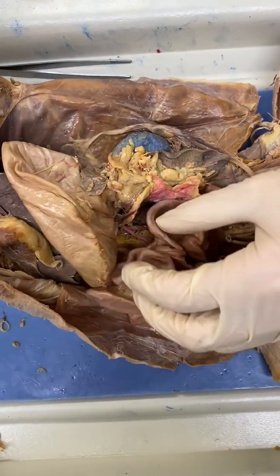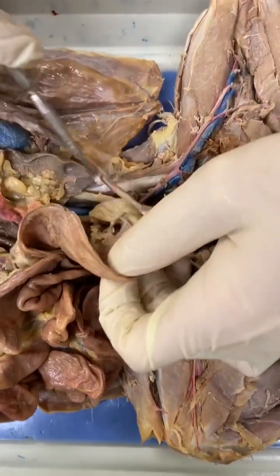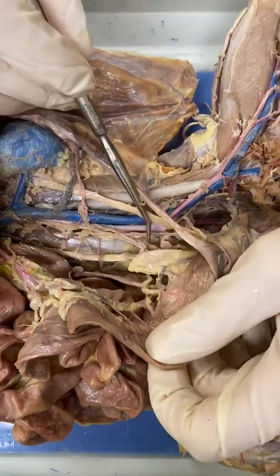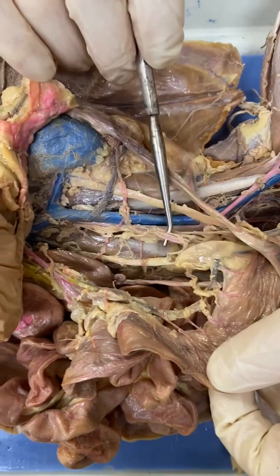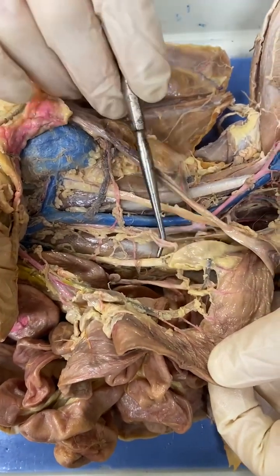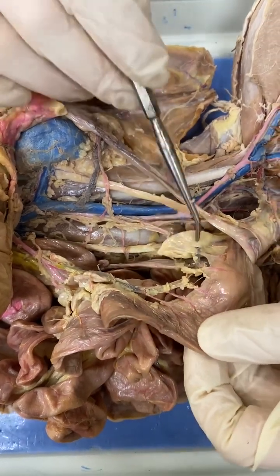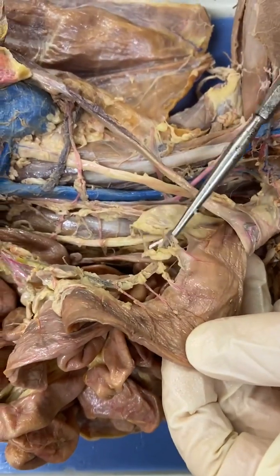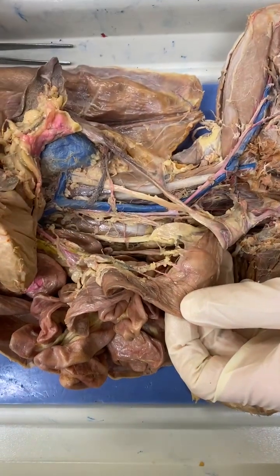Caudal mesenteric artery and vein. You have a good caudal mesenteric artery going off the aorta here, coming off the dorsal aorta. Do you have the caudal mesenteric vein? I believe it would be this vein here, next to it. Hepatic portal vein.